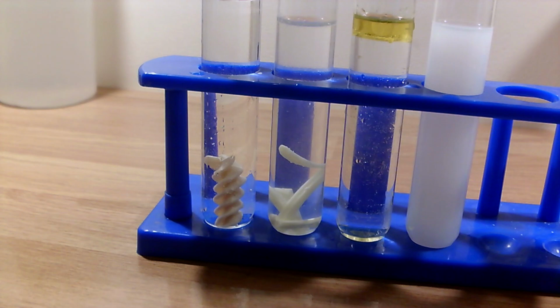The colour of the pasta doesn't change because the pasta doesn't contain lipids, but the water at the top of the test tube that has the cheese in it has gone cloudy at the top because the cheese contains some lipids. The oil has gone really cloudy because the oil contains lots of lipids. The colour of the milk hasn't changed. It is difficult for us to know if the milk has gone cloudy because the colour of the milk is already cloudy, but this test shows that oil contains lots of fat and that the cheese contains some. The other 2 foods that we have tested have got a negative test.